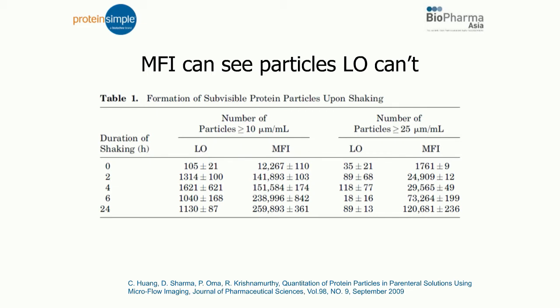And these are not particles that are on the edges of the limits of detection of these two systems. These are greater than 10 microns and greater than 25. So these are highly relevant to the size ranges mandated by the Pharmacopeia.